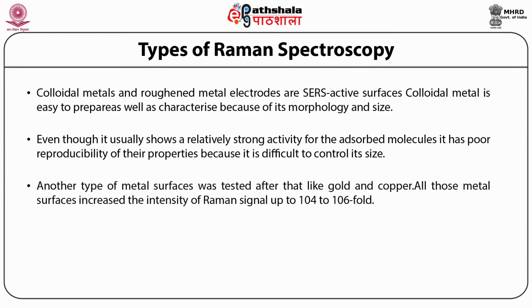Another type of metal surfaces was tested after that, like gold and copper. All those metal surfaces increased the intensity of Raman signal up to 10^4 to 10^6 fold.